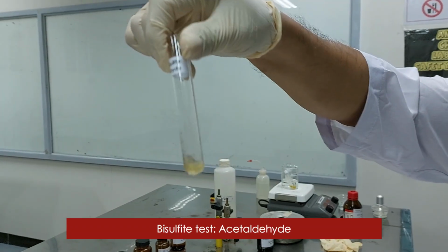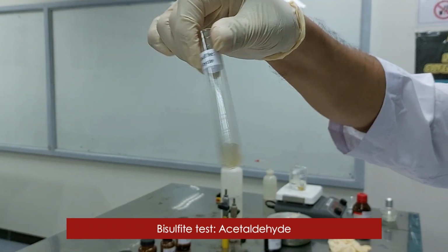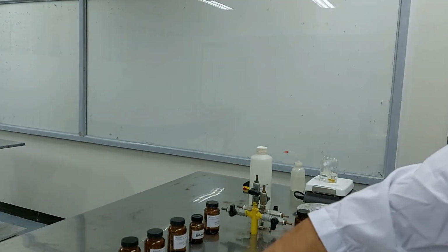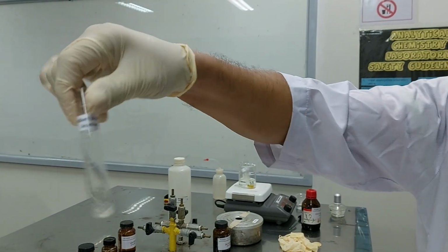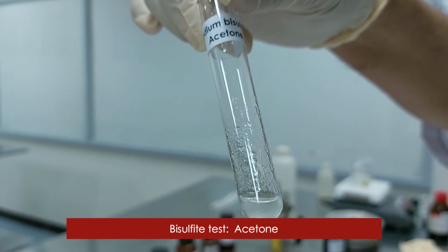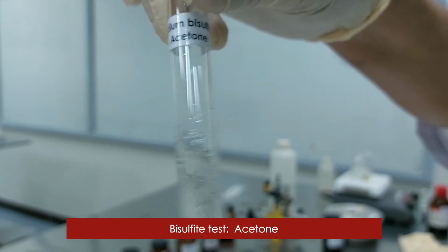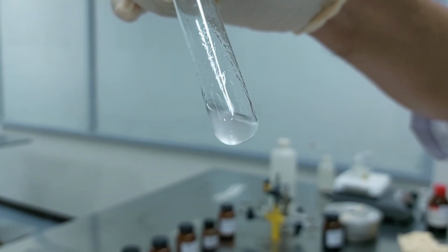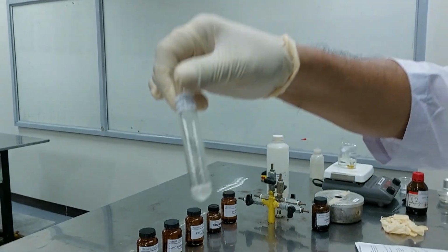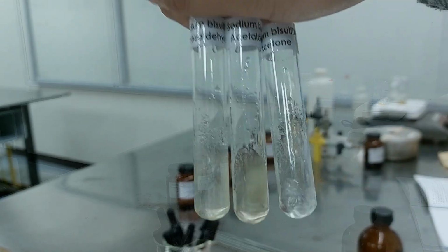The solution turns cloudy already, indicating the presence of precipitate. Now, the last one is acetone. You also have the cloudy color, that is also white. So all are positive to sodium bisulfite.